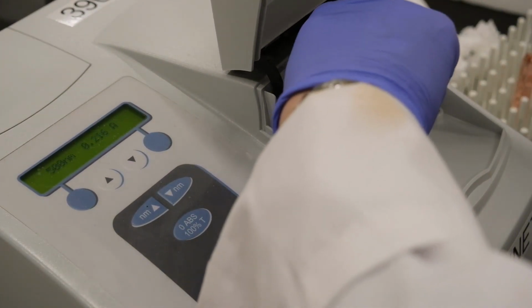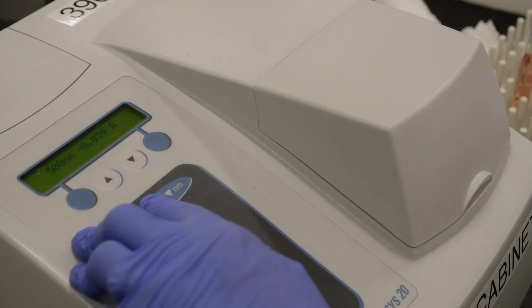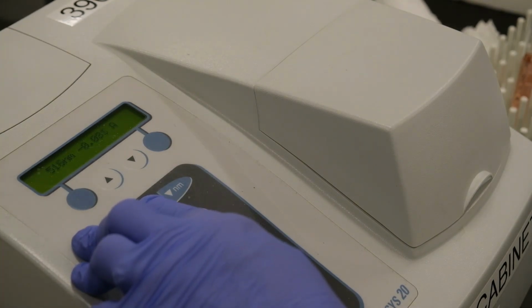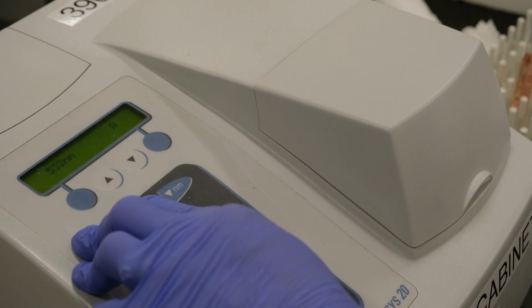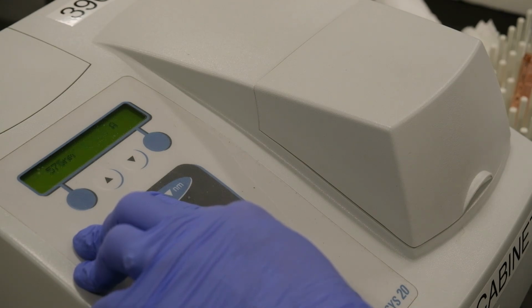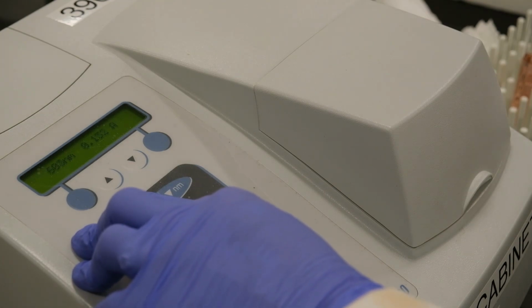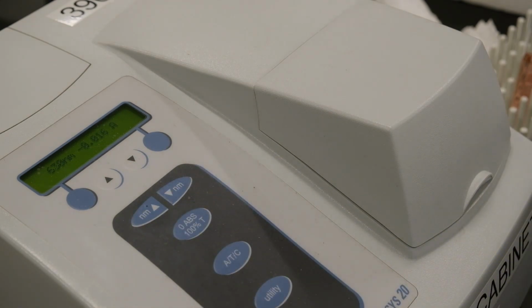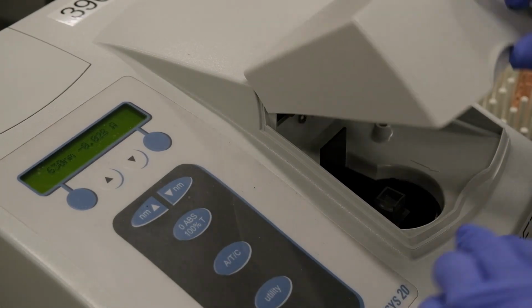And then we set the wavelength at the maximum that we had for the second experiment, experiment 14. Again, we tare the instrument with a blank.